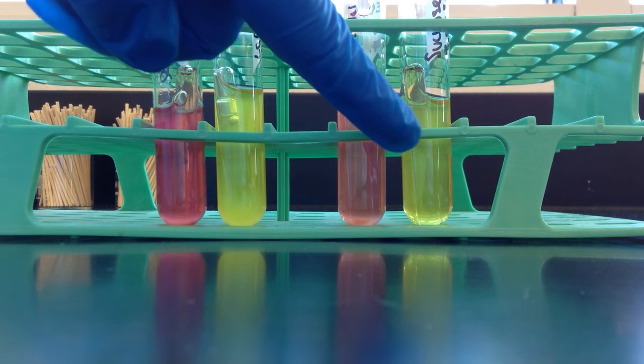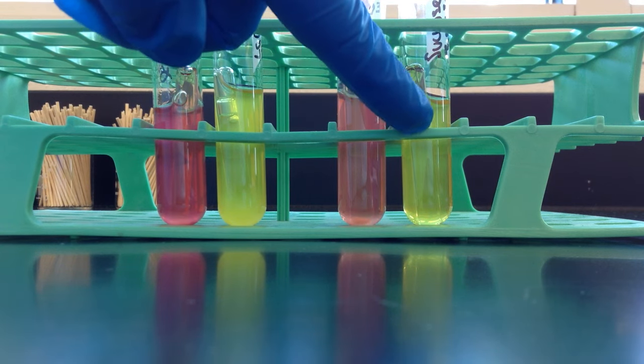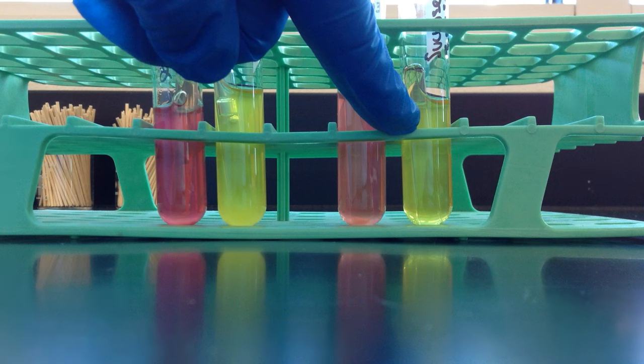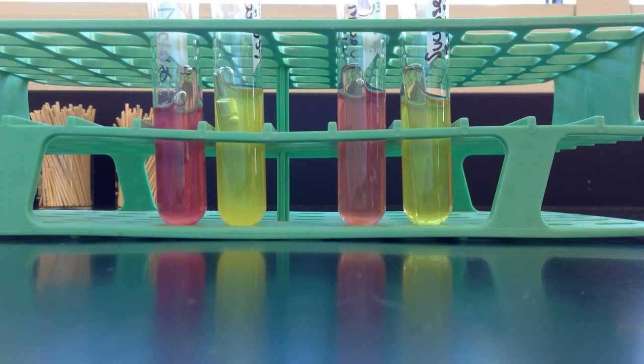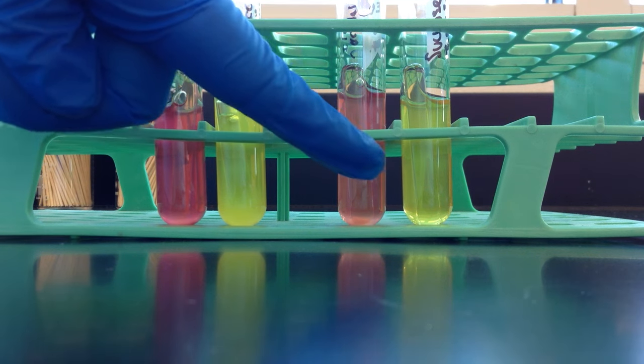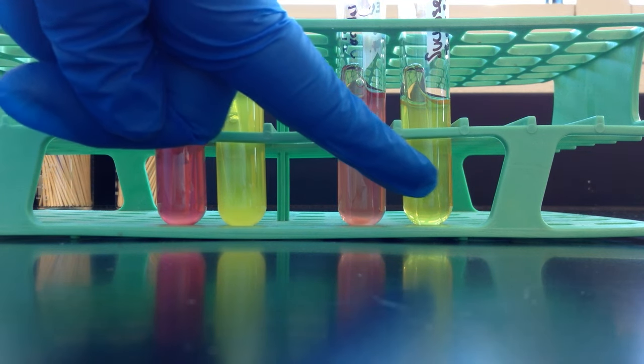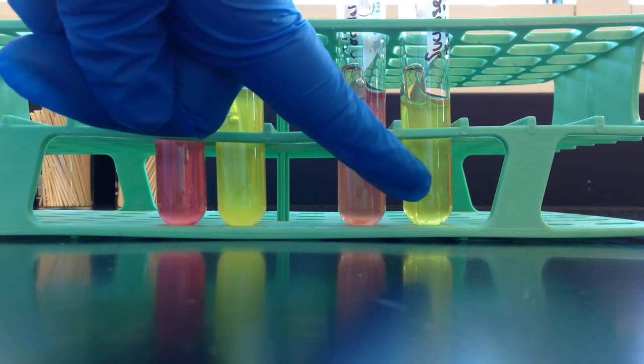So the yellow product indicates acid production. Phenol red, which is our indicator, turns yellow. So in this case, since sucrose is a simple sugar that's used, we can say that the organism is positive for the fermentation of sucrose, or we can say has the sucrase enzyme.